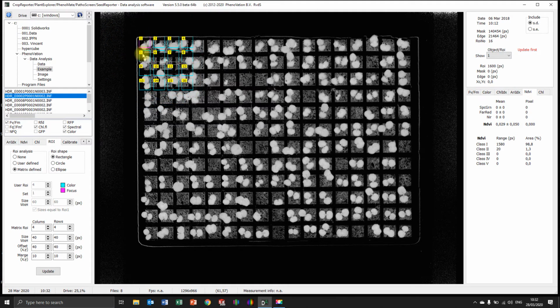You can see it sometimes doesn't go that smoothly, but if you lower it, so do fewer columns, it will be faster. If you do this with 200, your computer will crash. So always make sure you do it with a couple. I always do it with 4x4, because then you can see if it will line up pretty good.